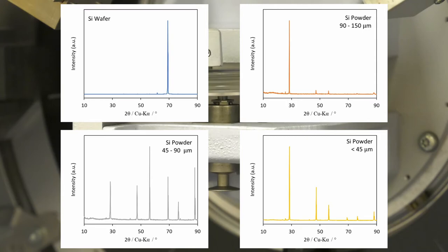These are the normalized results from XRD. You will be given the data to graph and analyze. Although all four samples are of the same material, they produce very different XRD patterns. Notice how the relative intensity of different peaks changes between the different samples. Students should think about what causes this and why preparation of fine particles is important for powder XRD.